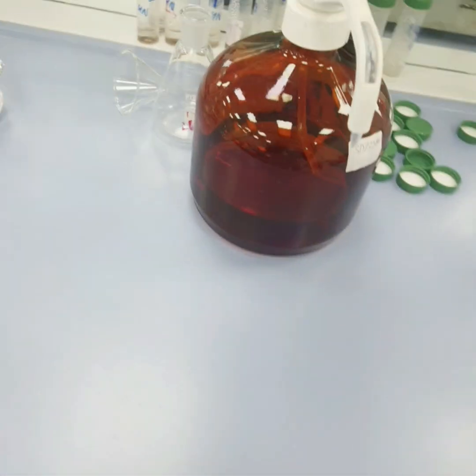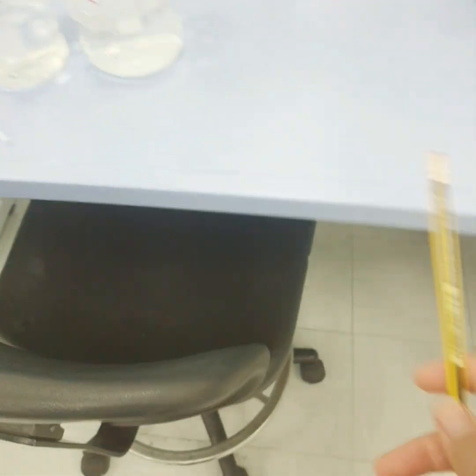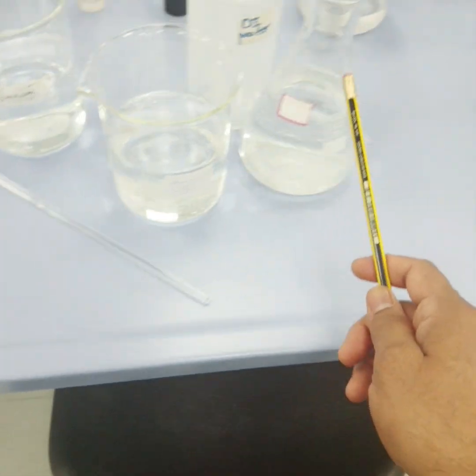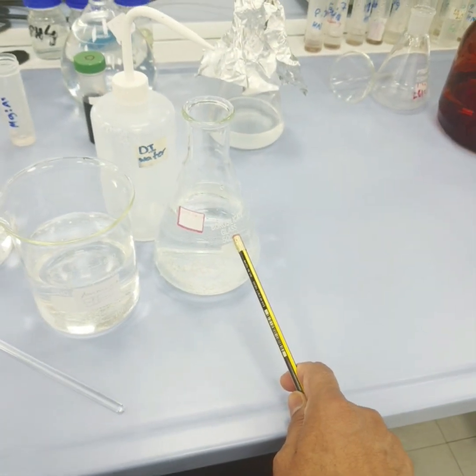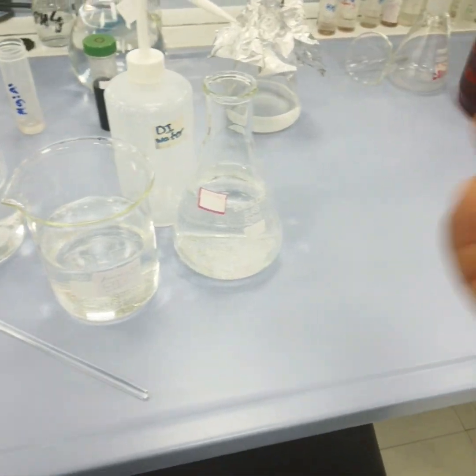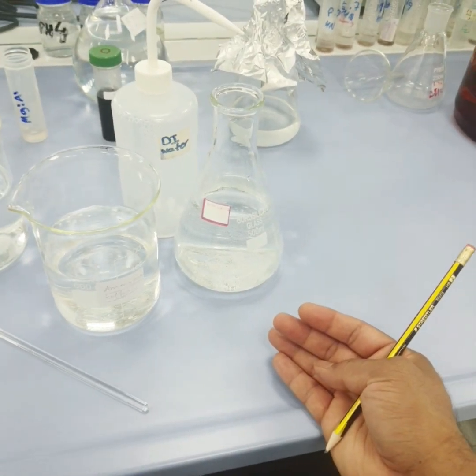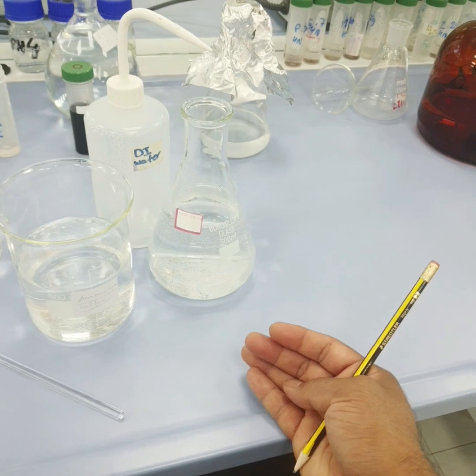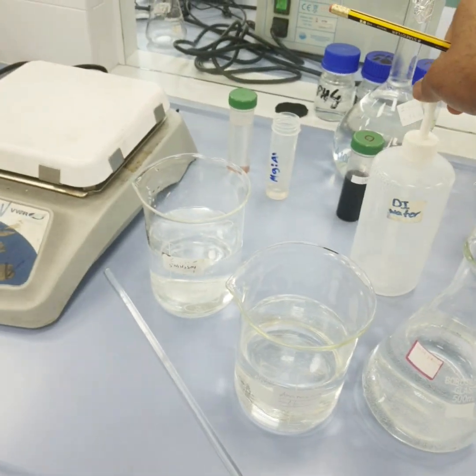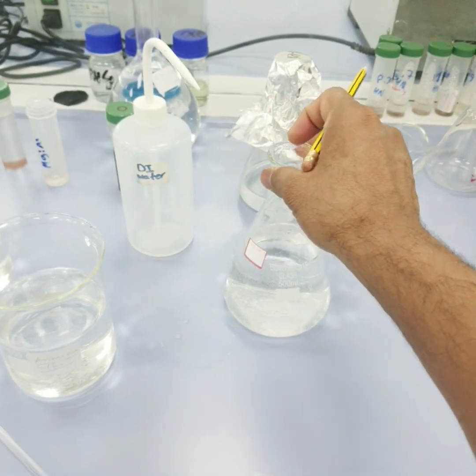So now for doing the hardness, we have three samples here. These two are hard water samples and this is my tap water sample. So we would take 50 ml of the sample. The volume is totally dependent on us.